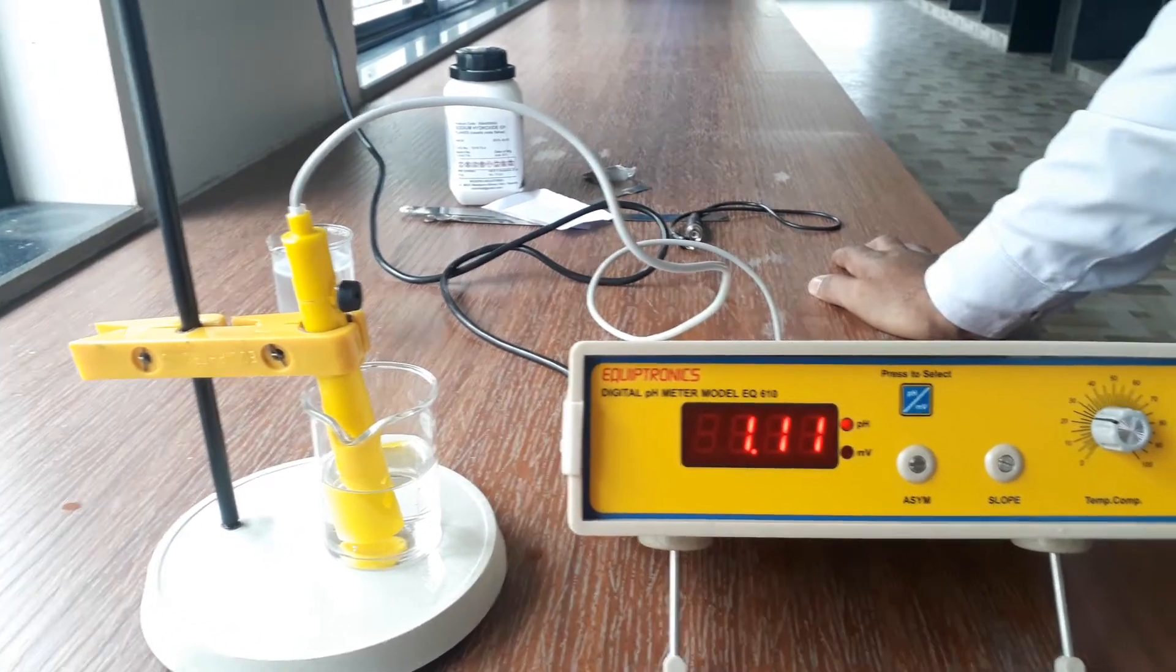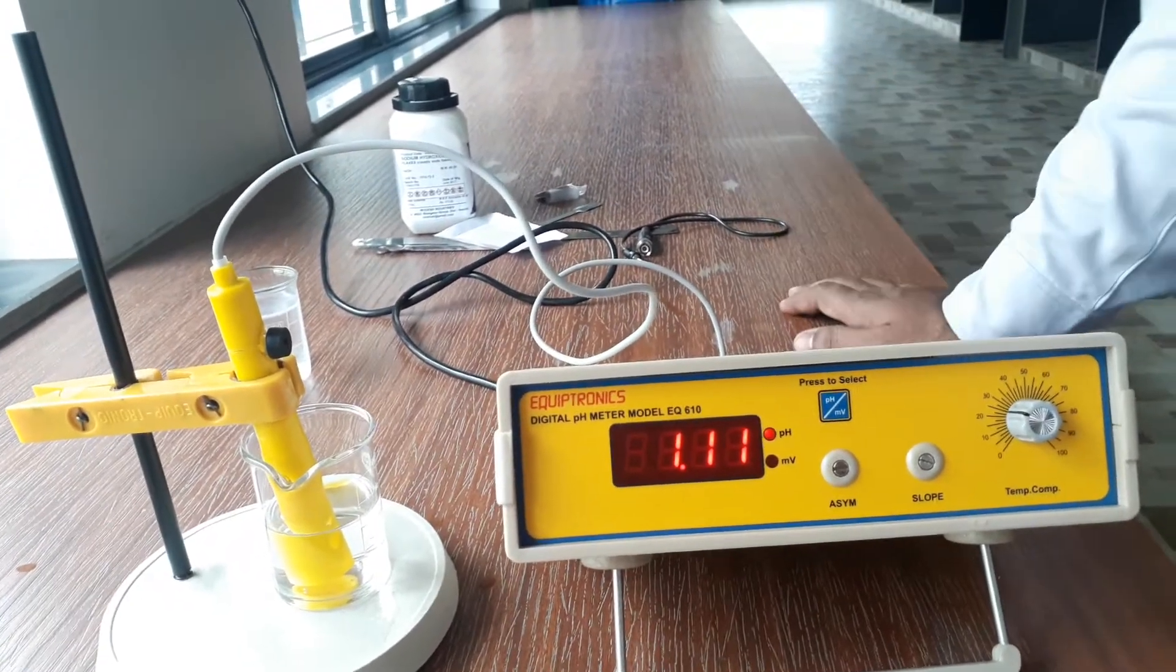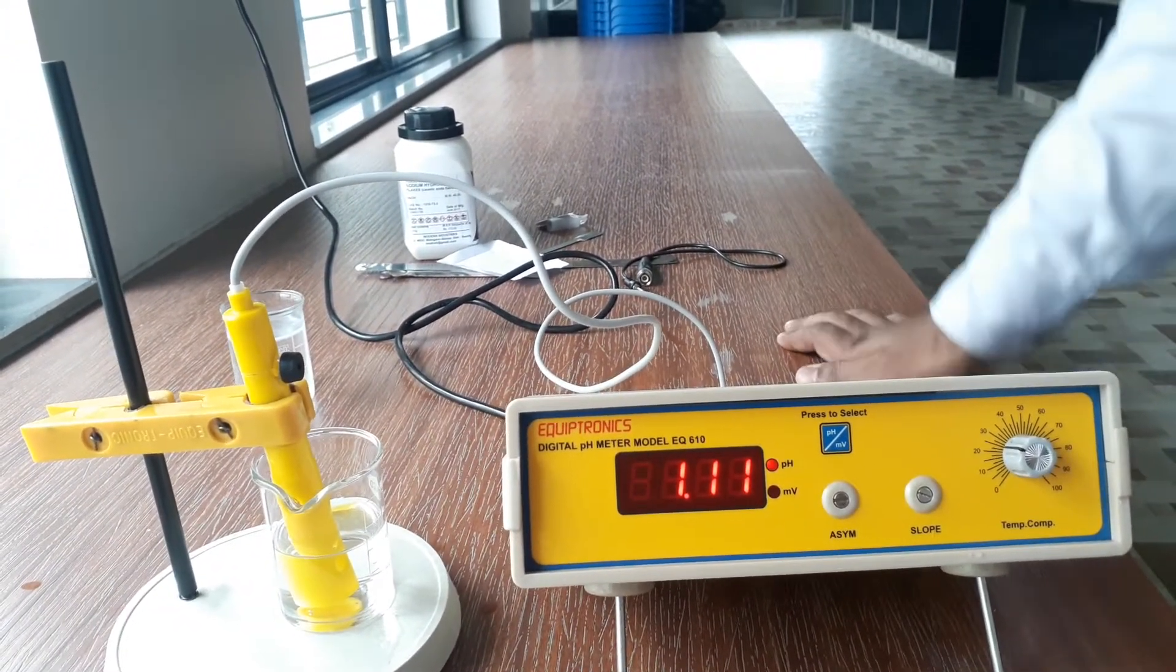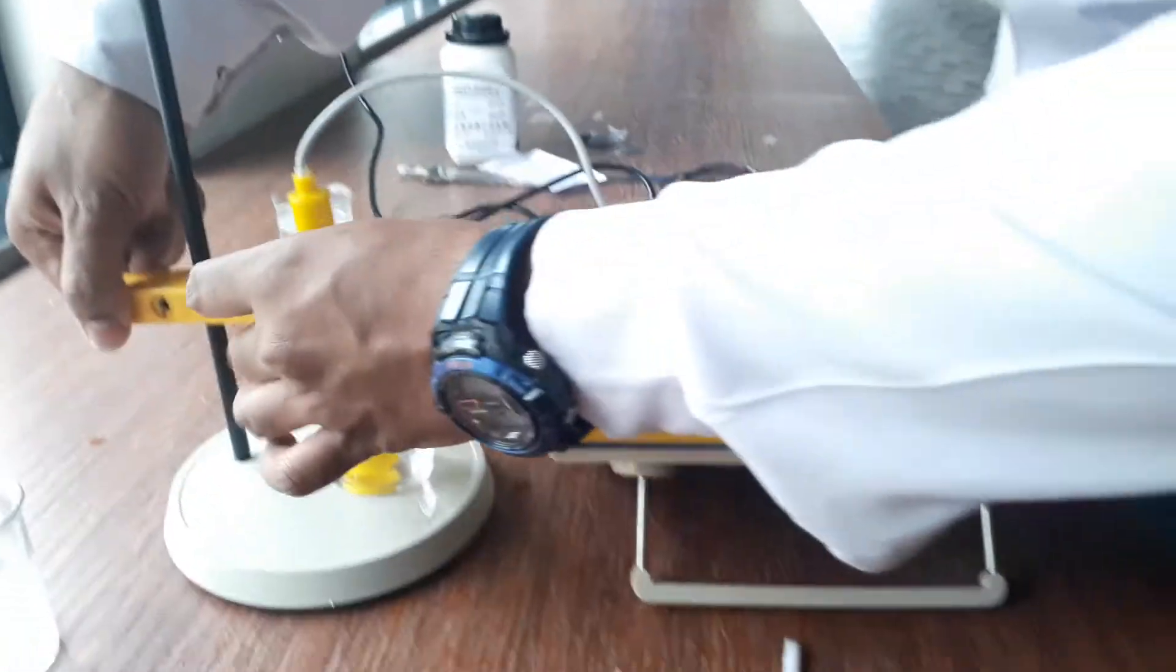Now we have noted: first we have noted the neutral solution that is water, second we have seen the pH value of acid that is hydrochloric acid. Now last solution we will take is NaOH, sodium hydroxide, which is one of the strongest base.